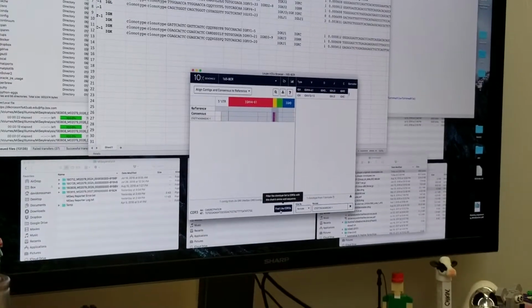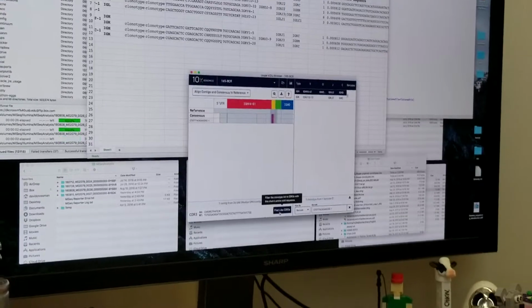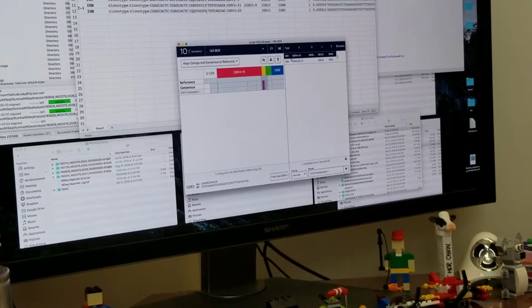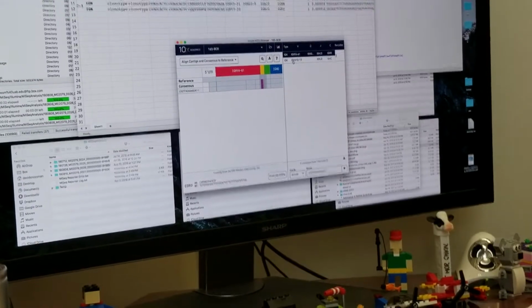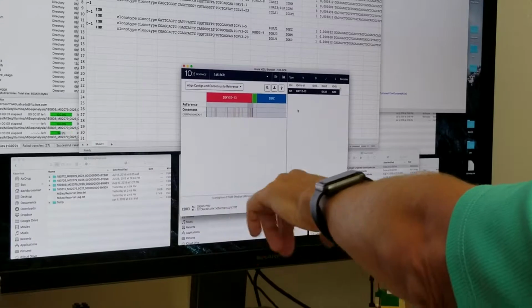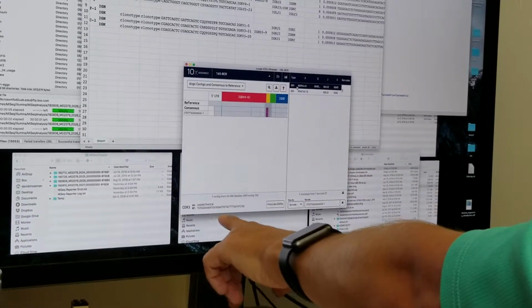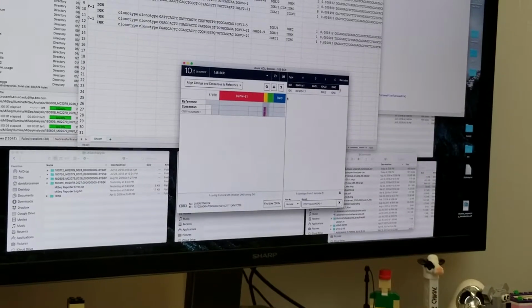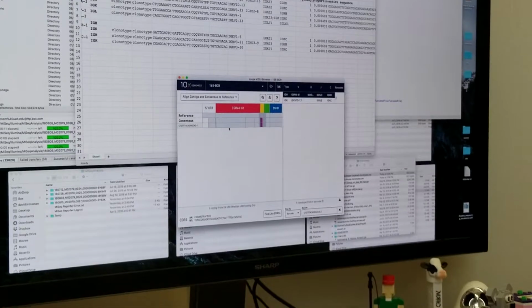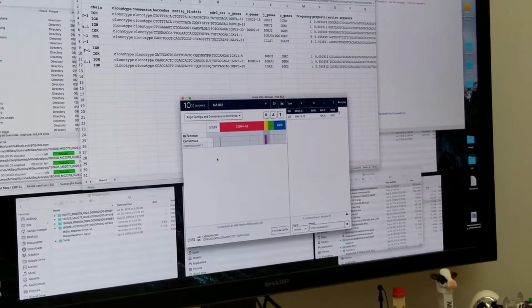Click this link and say find like CDR3s, but I haven't had any success with that lately. Can I ask how that CDR3 just came up right when I wanted it to? Did you move that slider? No, I didn't, because it's always present at the bottom. Whatever barcode you search for, whatever you click on, it changes to whatever I'm looking at. So this is the CDR3 for this particular heavy chain of that particular barcode.